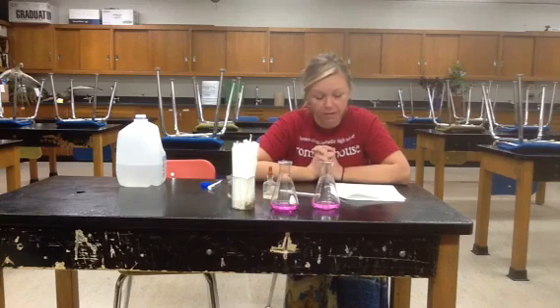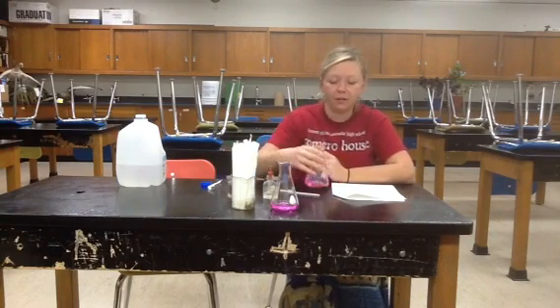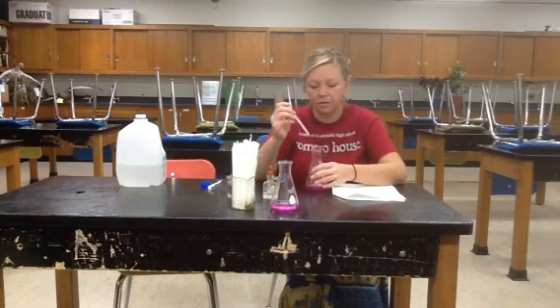Then what you're going to do is exercise vigorously for 2 minutes. This can include running in place, push-ups, sit-ups, jumping jacks. Jumping jacks are a good one. And again, don't be disruptive. You may use some of the space in the hallway, but don't be disruptive. You're going to do that for 2 minutes, and then you're going to come back and blow in your flask once again for 20 seconds. So you'll blow in here for 20 seconds.